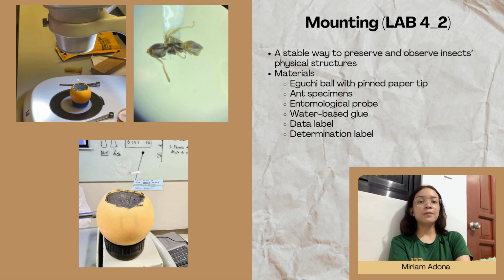In summary, mounting through pinning is crucial for preserving and examining ants in entomology. Proper orientation, minimal glue use, and accurate labeling ensure that key features are visible and the specimen is ready for study and identification. Following this, the ant identification will be discussed by Ms.